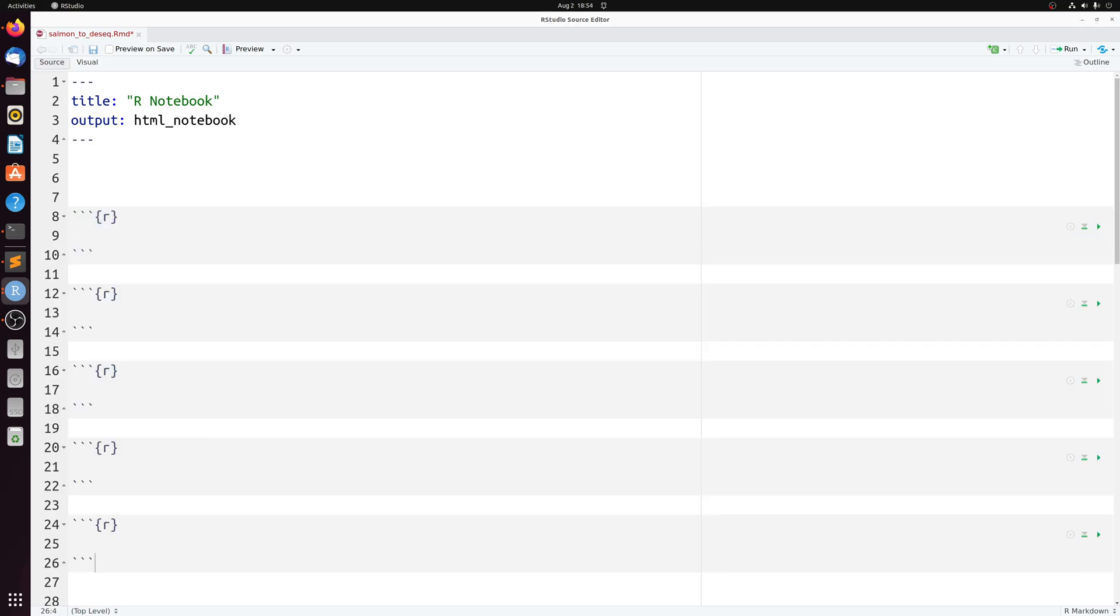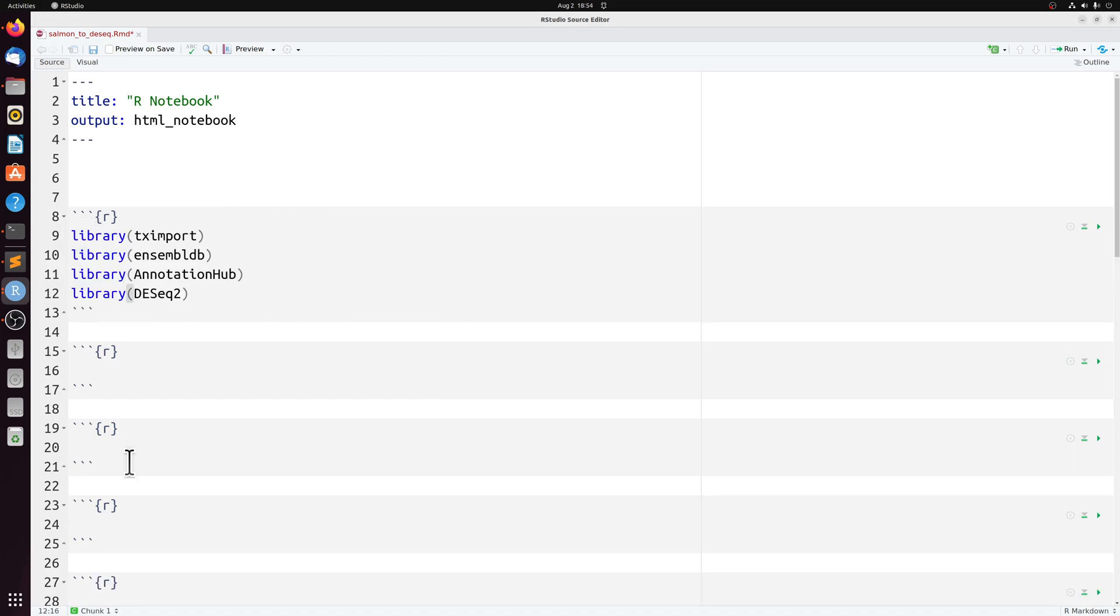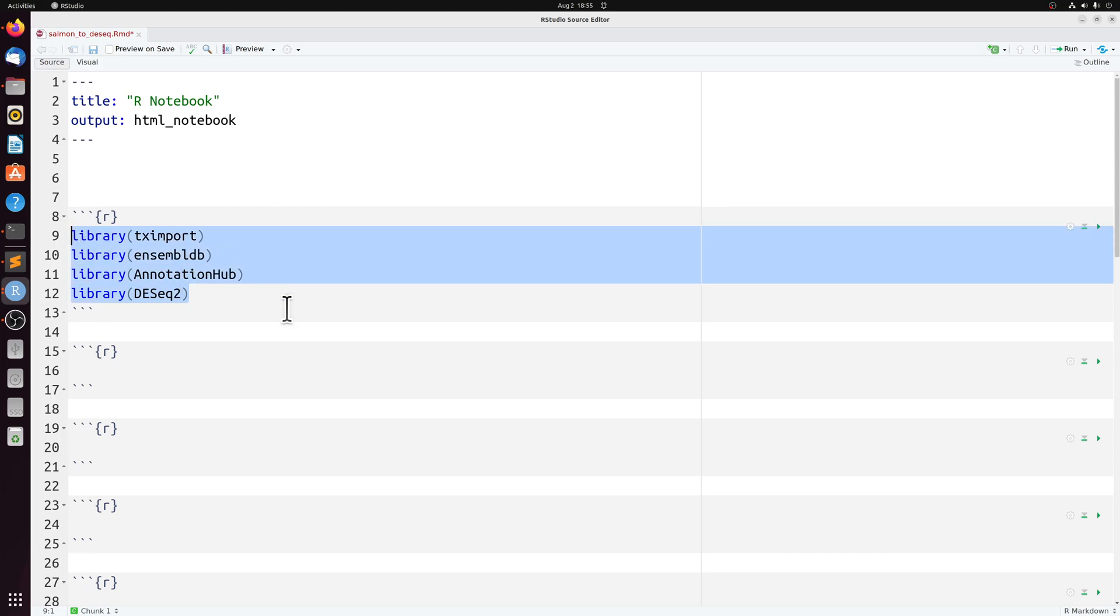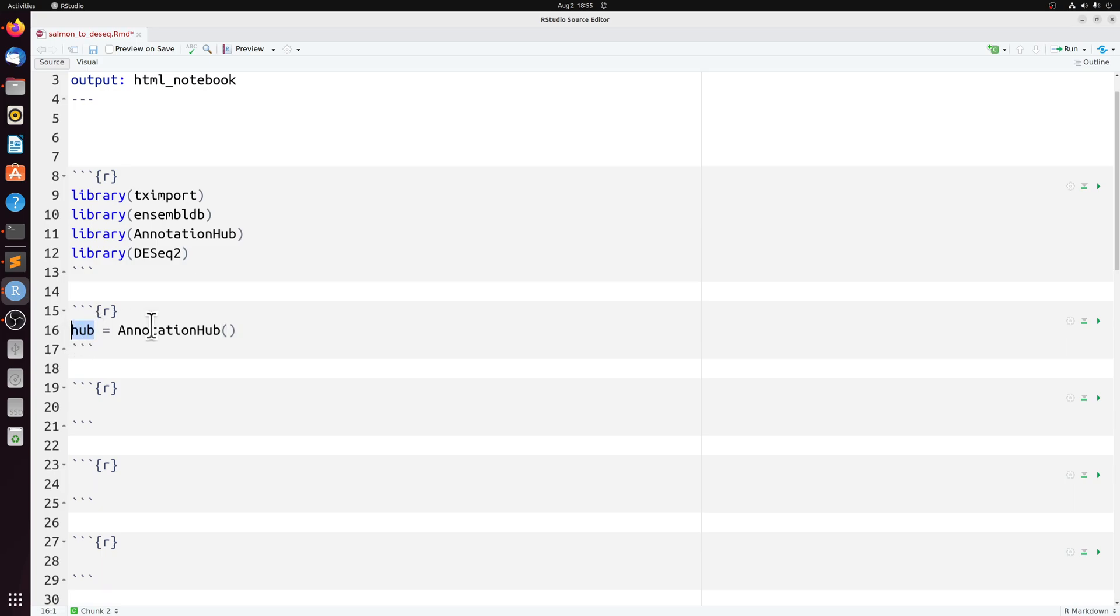So I started an R notebook inside the same directory that we have our salmon output parent directory. And we're going to need a few libraries: tximport, but we're also going to need EnsemblDb annotation hub. And if you want to do your differential expression in DESeq, if you don't have any of these, you'll need to install them through Bioconductor. And we're going to start by initializing annotation hub.